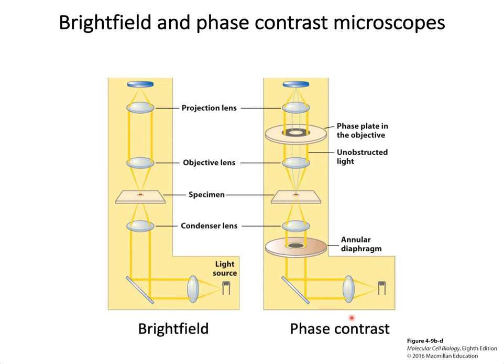In phase contrast microscopy, which increases the contrast of biological specimens, the incident light passing through an annular diaphragm focuses a circular annulus, or ring, of light onto the specimen. Light passing unobstructed through the specimen is focused by the objective lens into the thicker gray ring of the phase plate, which absorbs some of the direct light and alters its phase by 1/4 of a wavelength.